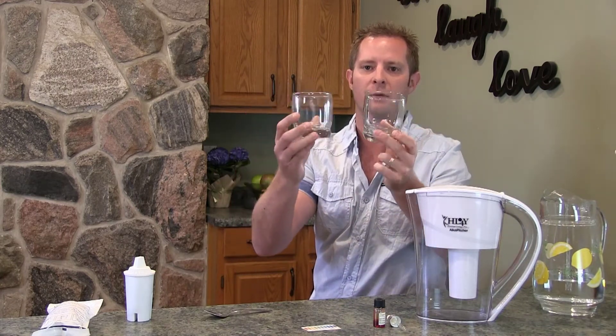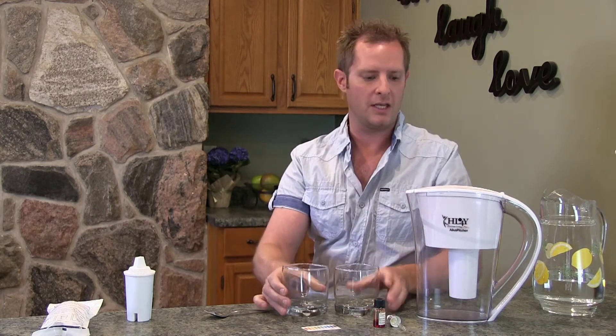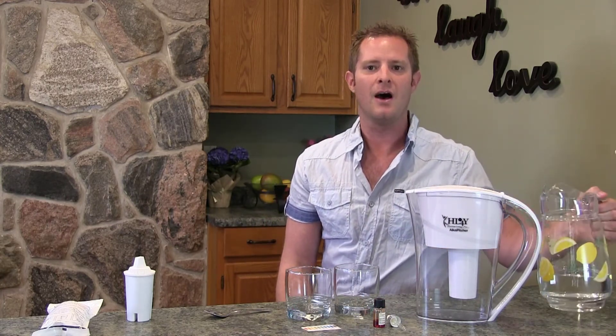I have two empty glasses. I like to use glass when doing this test — it's best for that. I'm going to put the Alka Pitcher water in one and regular tap water in the other.